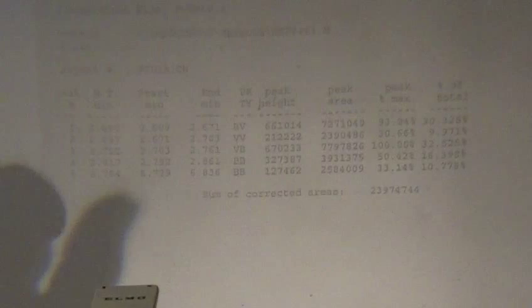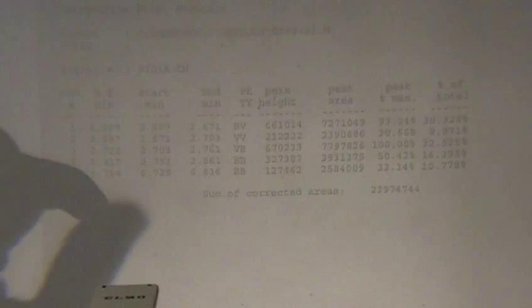But in those retention times, we'll show you the trends of cis and trans alkenes, and the trends in positional alkenes, like 2-heptene, 3-heptene, 4-heptene. What are the retention times? Make sure you get that information from your professor because you'll need that for figuring out this data.